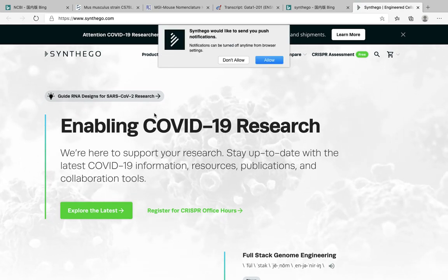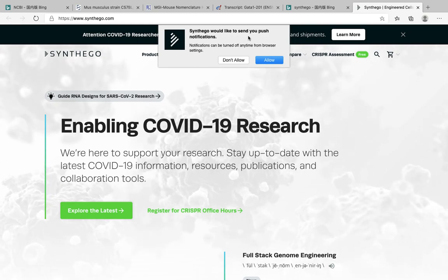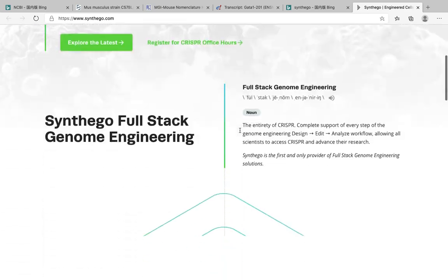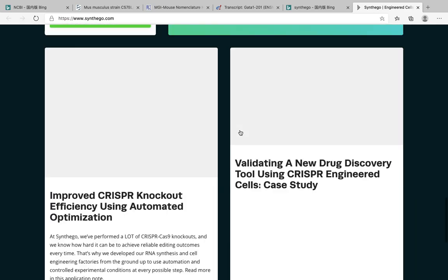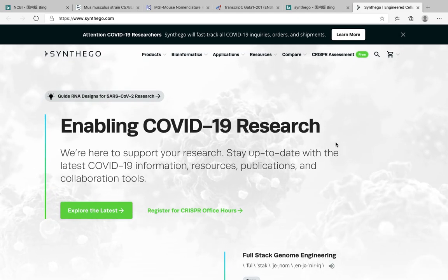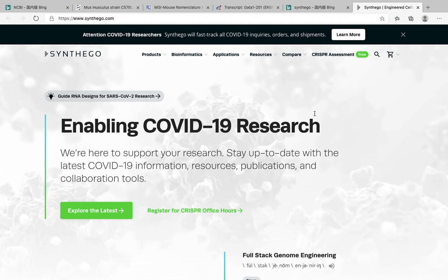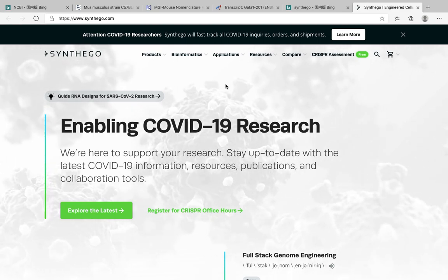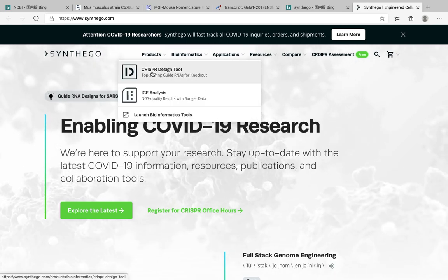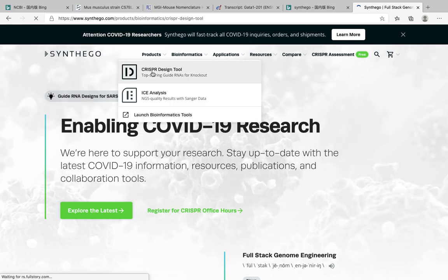Yes, we got this website. Synthego would like to send you push notifications. No, don't allow. Okay. So here you can read this website. There is a lot of useful information in this website, but what I need, we will go to the bioinformatics CRISPR design tool.